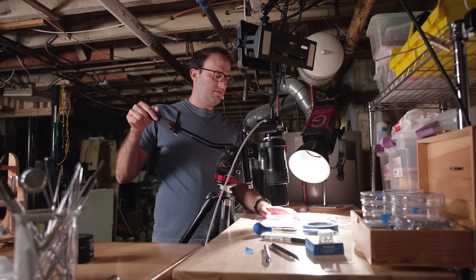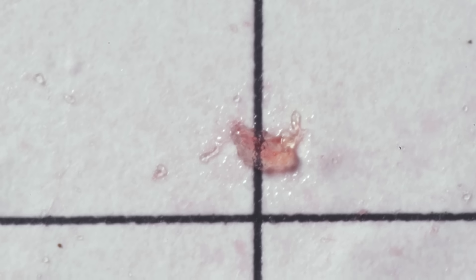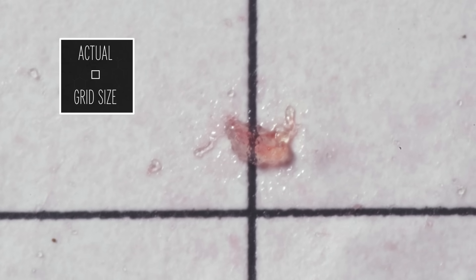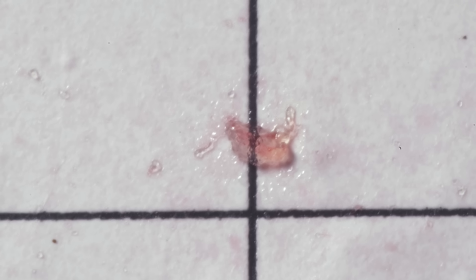A couple days later I pulled it out to look at it under the microscope, and I could actually see stuff with my naked eye. Look at all this stuff. Each of these little boxes on the screen is three millimeters by three millimeters. That big pink glob is about 800 microns in diameter.